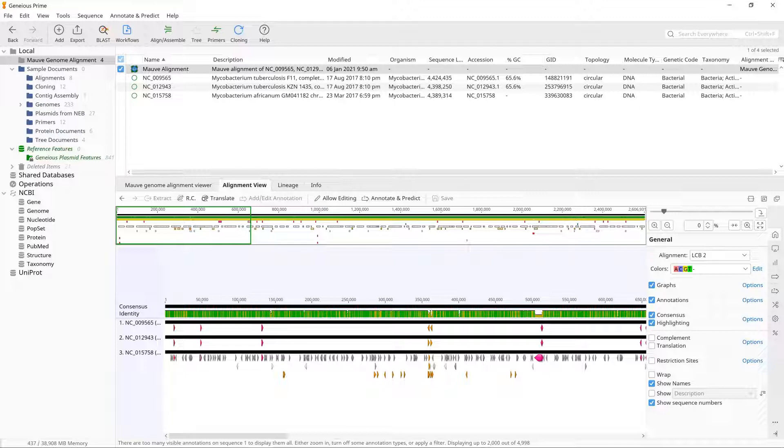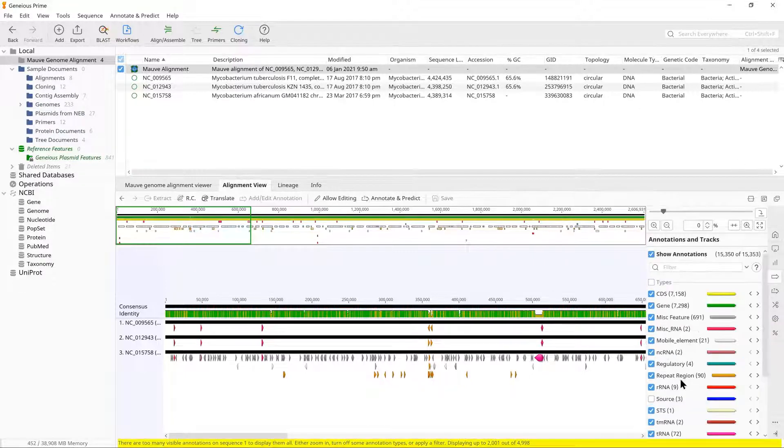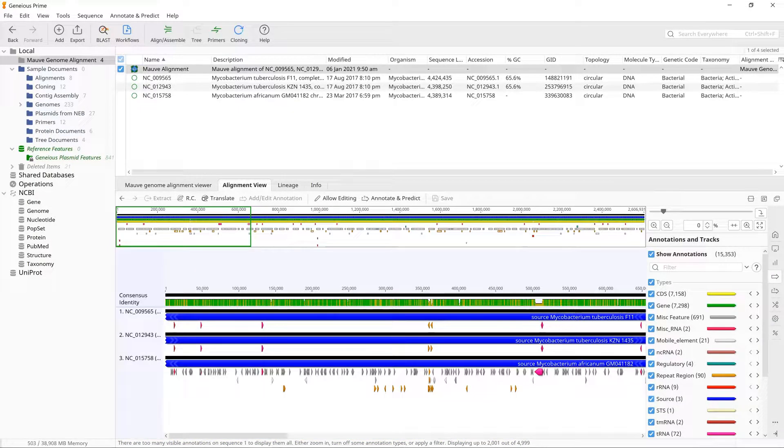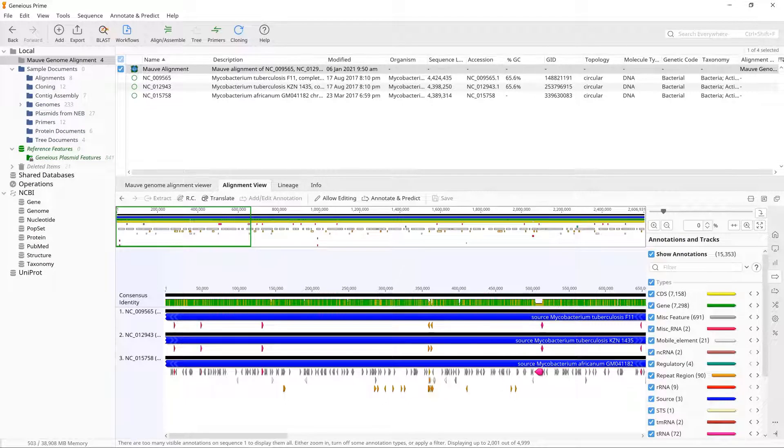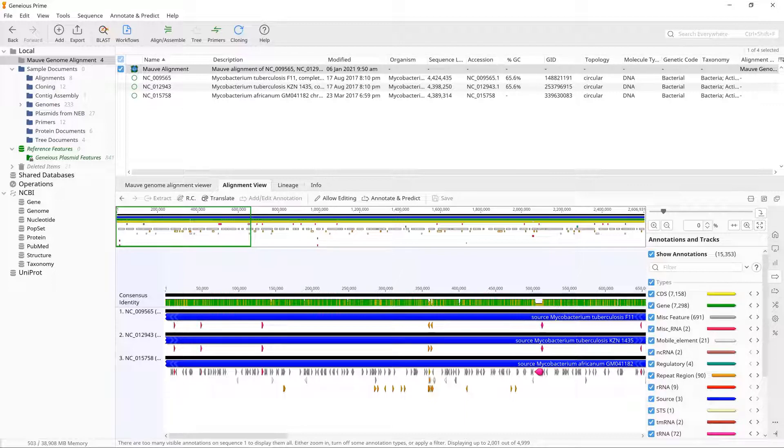If you cannot see the blue source annotations, make sure the annotation type source is checked in the Annotations and Tracks panel. This alignment view works the same way as the regular Genius alignment viewer and has the same controls for zooming, sequence display, and annotations.